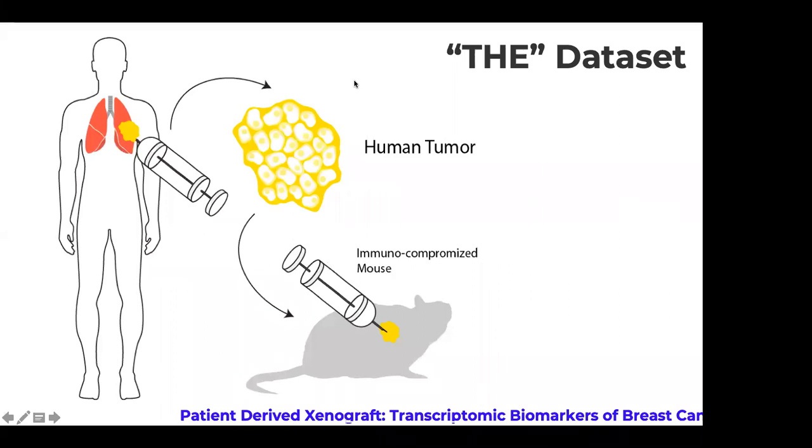The data set. The data set is very critical, and I think it's an important slide here for everyone to be a little focused. The data set we will be using is an educational data set based on public domain data from a publication by an author called Bradford et al., 2016. We will be sharing this publication with you in the next email.